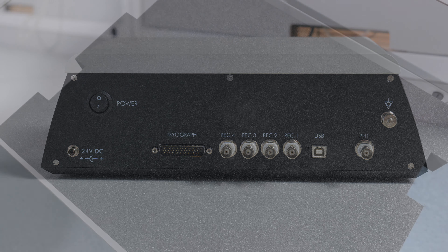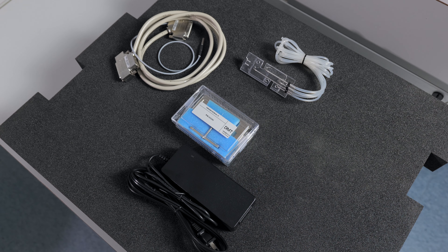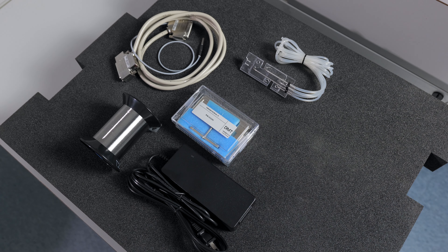The accessories that come with your system include the myograph cable which will connect the interface and the chamber, as well as the connected temperature probe. A power supply. A calibration kit to maintain the accuracy of the force transducer. A chamber cover with connections for gas bubbling and bath removal, in addition to ports for the temperature probe and replacing the bath.